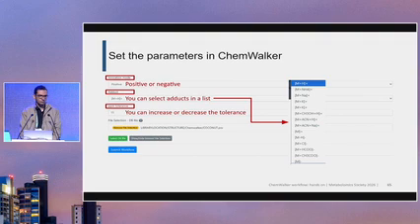Also, one of the internal standards is also a drug, so we could keep track of that information. But when you are doing untargeted work and don't have much information on the things you're looking at, my suggestion is to set it as low as possible. For the drug readouts, I think the lowest we allowed for now is 100 or 1,000, I'm not sure right now, just because 0 is going to show everything, and it's going to be a mess.